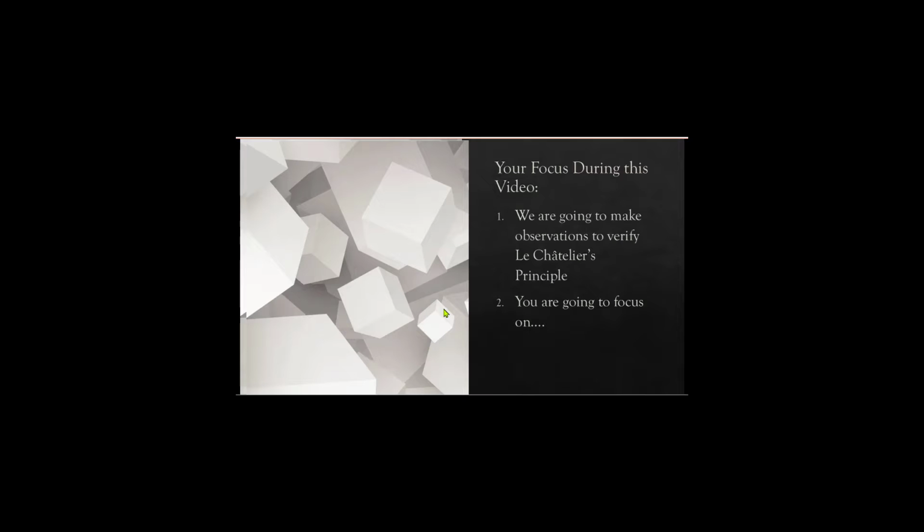As you're doing the lab today, I really want you to focus on these three things. First off, what is the original equilibrium state? So what we're going to do is set up a reaction and allow it to come to equilibrium. That's going to be the original equilibrium state. What color or state indicated, is it solid, liquid, gas? And what color indicates that you're in that original equilibrium state? So that's part one. And again, taking pictures, screenshots is going to be real important. It'll be great to be presenting a lot of pictures during this lab write-up. Pictures worth a million words, as they say.